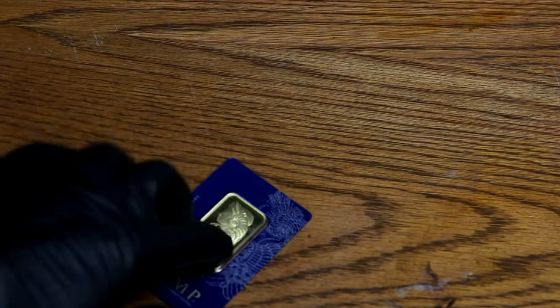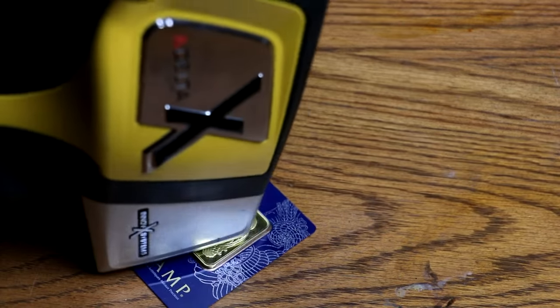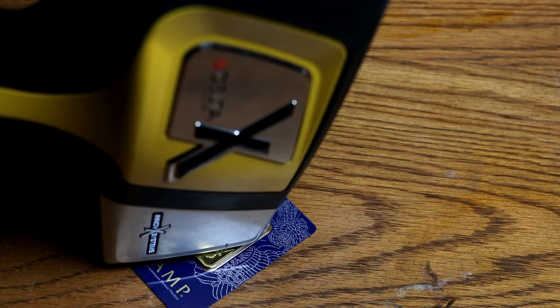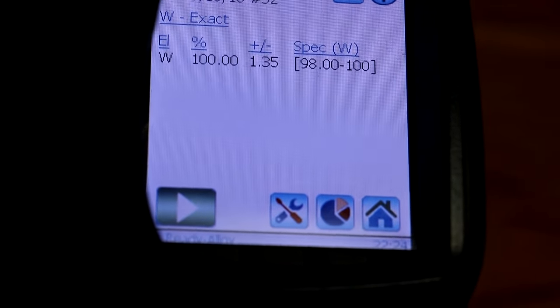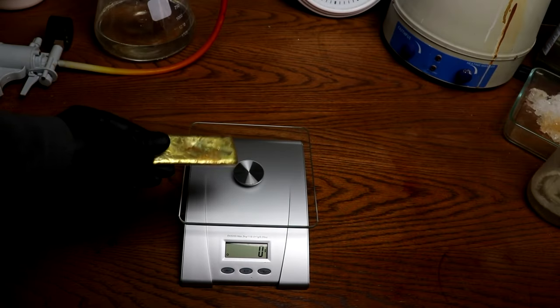There it is. Just for fun, let's also check one of these commercially made gold bars, which should be at least three nines fine. So, set it on there. Let's check it. Okay, it is done. Let's bring this down. And yeah, it's telling me that it's 100% pure. Yeah, which makes sense.